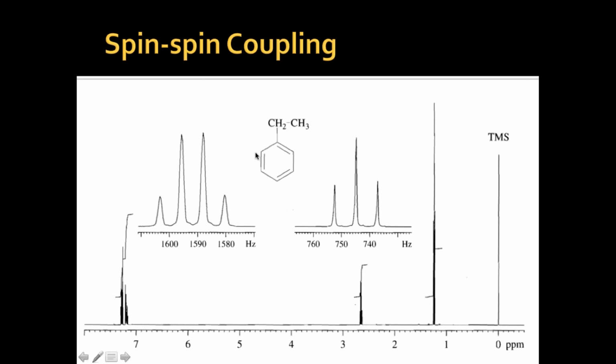All right. And the benzene ring is the same as before. As we said, they all are coupling with each other. There is no functional group, so all of them show up almost in the same place, at about 7.45 or 7.3. So in this spectrum, once you see it without being given the molecule, what you can see is some aliphatic group. Aliphatic means without aromatic, of course. Aliphatic means some CH3, some CH2. And you can see some aromatic group.